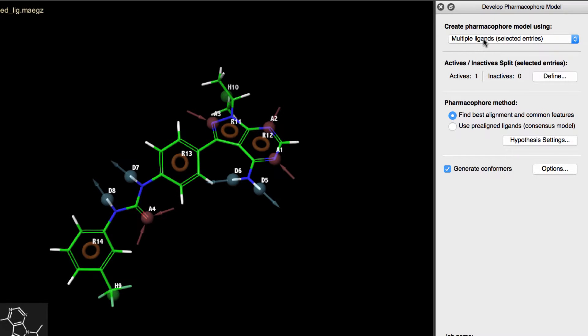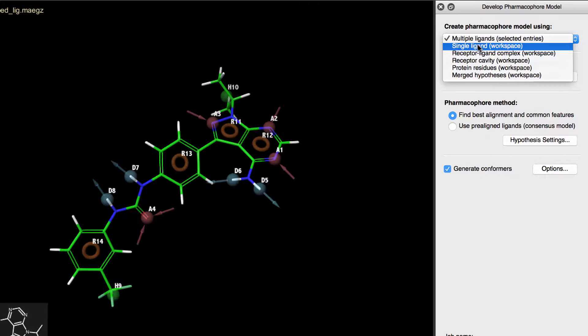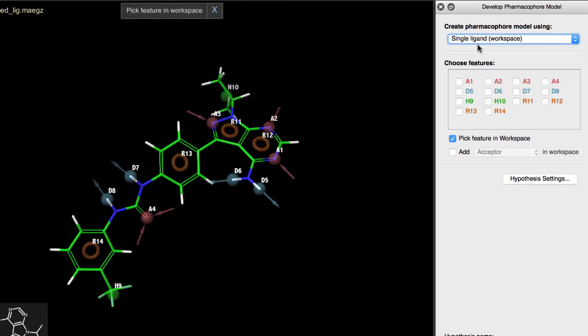Next, with our ligand in the workspace, we'll change Create Pharmacophore Model Using to Single Ligand Workspace, and notice that the panel has now adapted to the single ligand workflow.